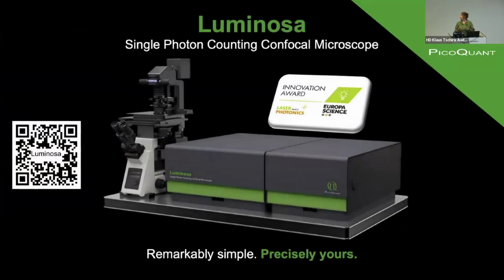So first to say, the software tool I'm going to introduce is based on the software that comes with our single photon counting confocal microscope, Luminosa, but it can also be used by all other PicoQuant systems and also LSM upgrade kits that use the PicoQuant FLIM kit. So if you have a Zeiss or a Nikon or Evident microscope with a PicoQuant kit, you can also use the software I'm going to introduce today.